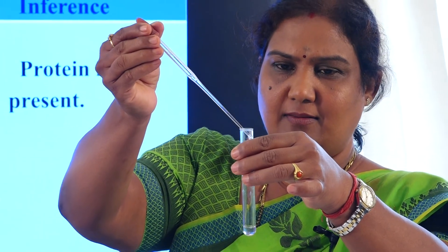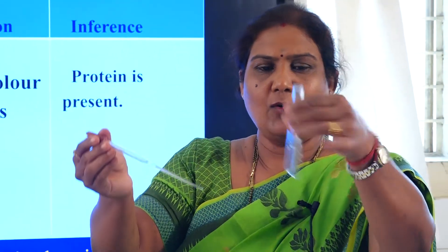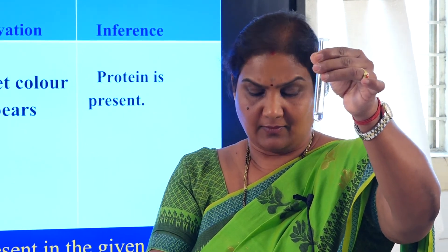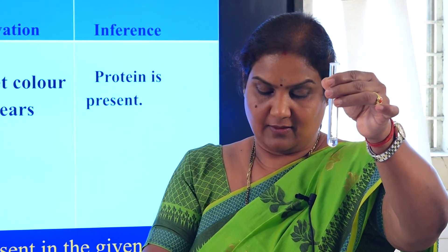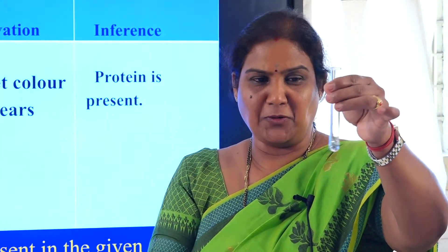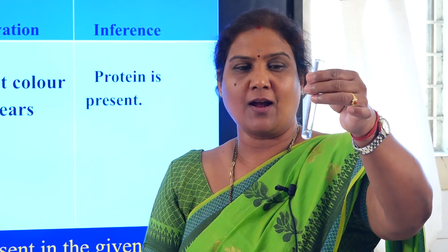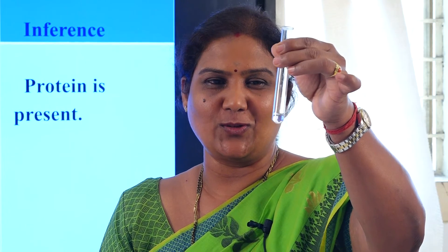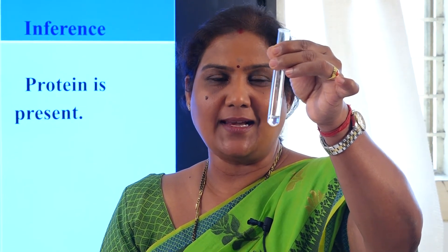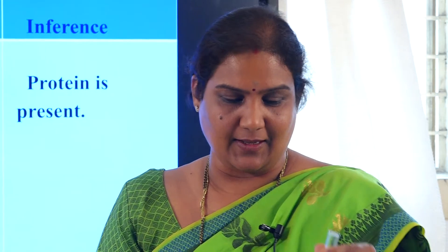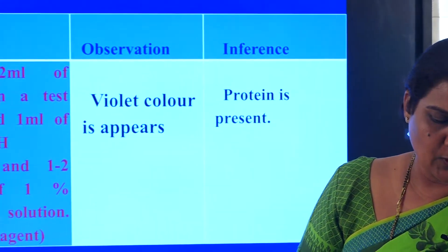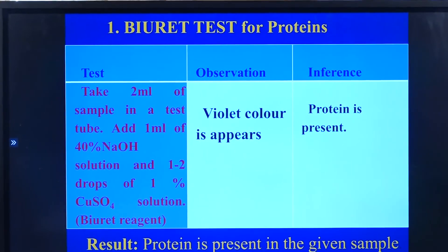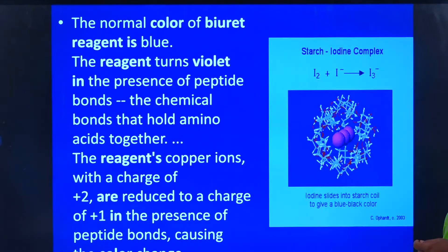We note the change: a very light violet colour appears. Do not add biuret reagent excessively — it's 1 to 2 drops that you are supposed to add, and it indicates the violet colour. The solution changes to violet colour indicating the presence of protein. In the observation you write: violet colour appears. Inference: protein is present.